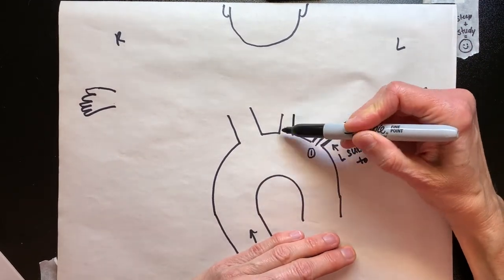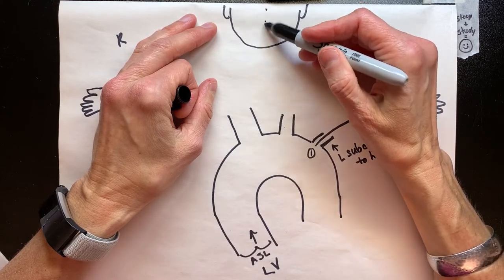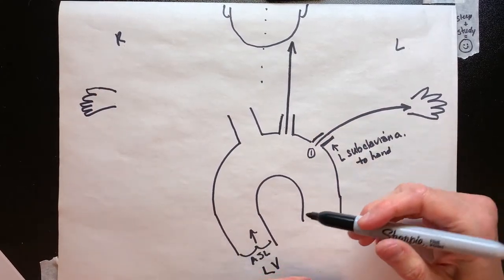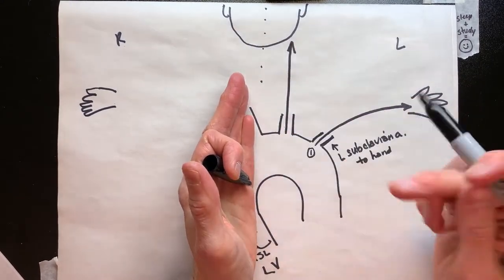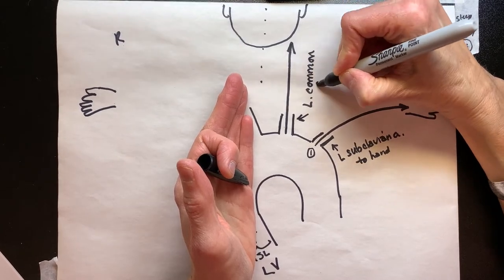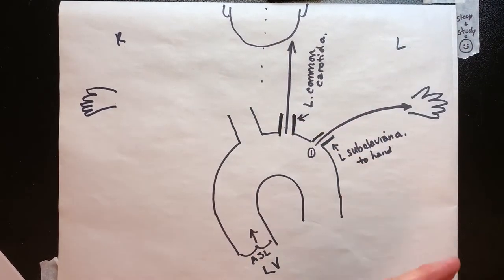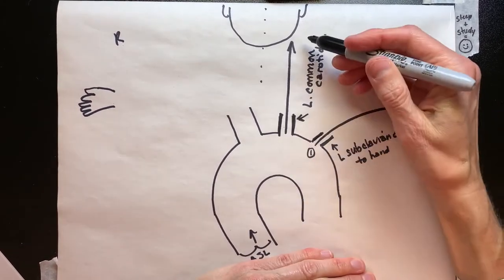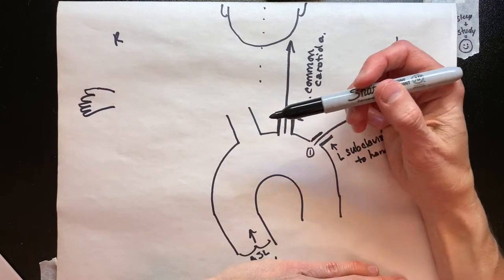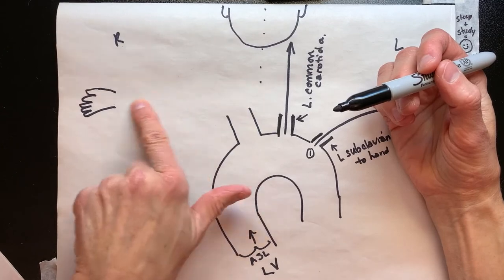The next branch off the aorta is pretty much right underneath the left cervical area, the left of the throat. Going straight up to the brain from the left side makes sense because the heart is already a little bit to the left. This is the left common carotid. I'm already on the left side because the heart is over to the left, so it's easy to go to the left arm and then go to the left side of the brain through the carotid and all its branches.